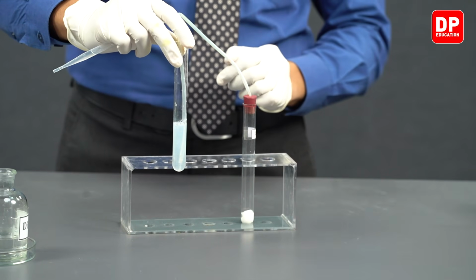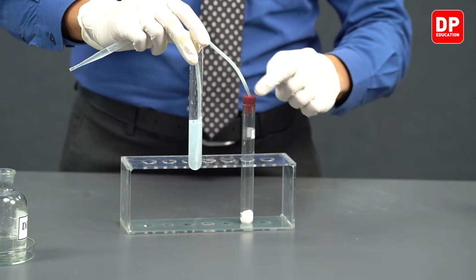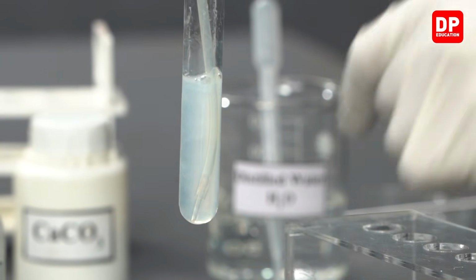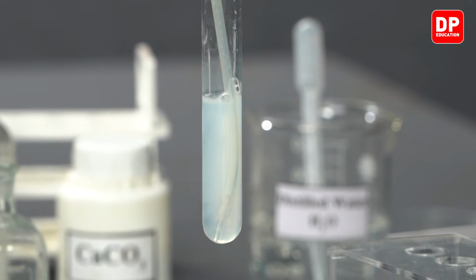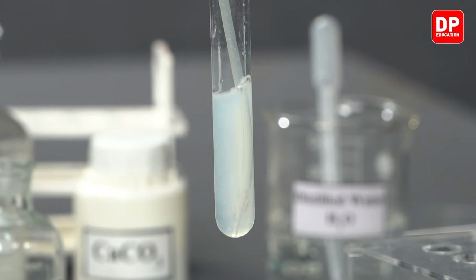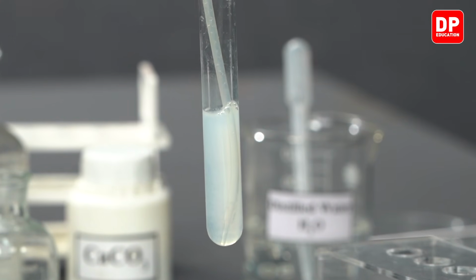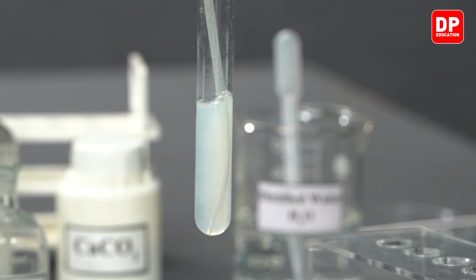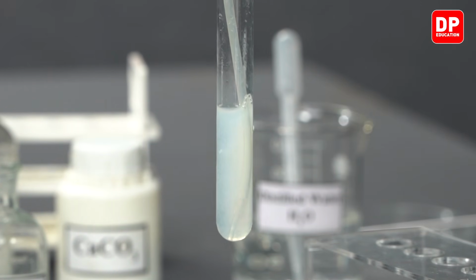Now students, you can observe, as I added hydrochloric acid to the carbonate, we produced a gas, and that gas was delivered through this delivery tube into lime water, and lime water turned milky. Lime water earlier was clear. Now you can observe that it is milky in nature. So now what we can do is we can continuously send more and more carbon dioxide through this and observe how this milky color will disappear.